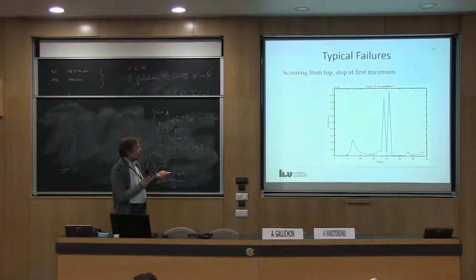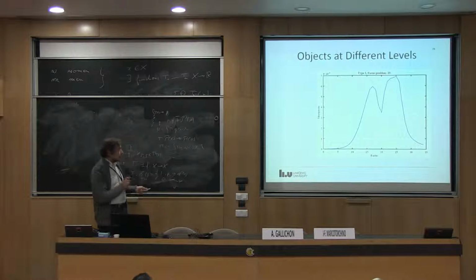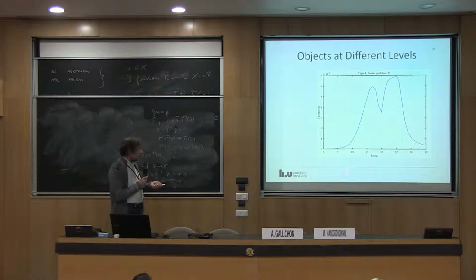And this is one of the cases where this one result here is wrong, because there was some artifact around position 7, 8. But then the real focus position here was correct. But since I broke here, then it was wrong. This one here is also a typical example when it may go wrong.